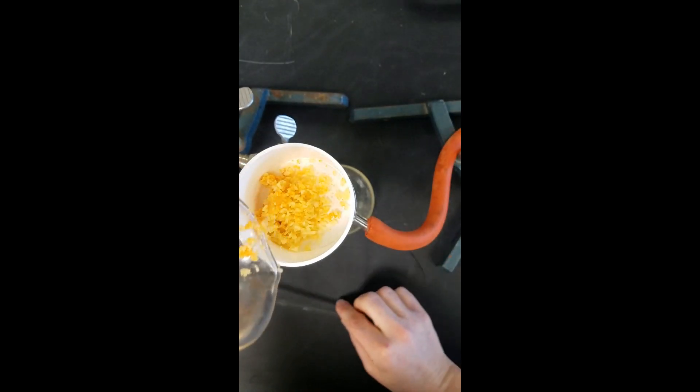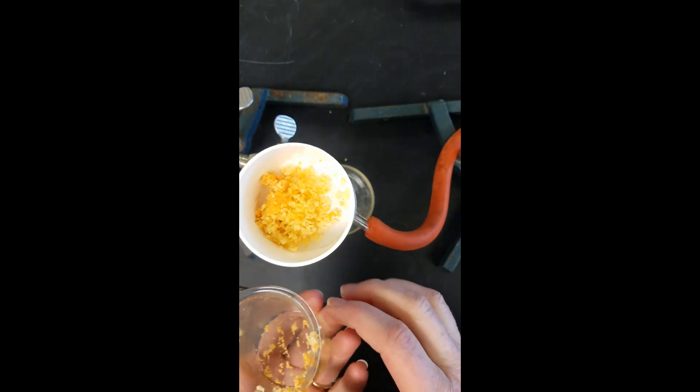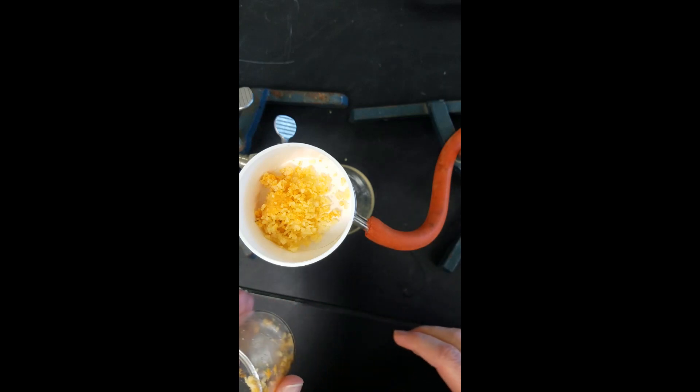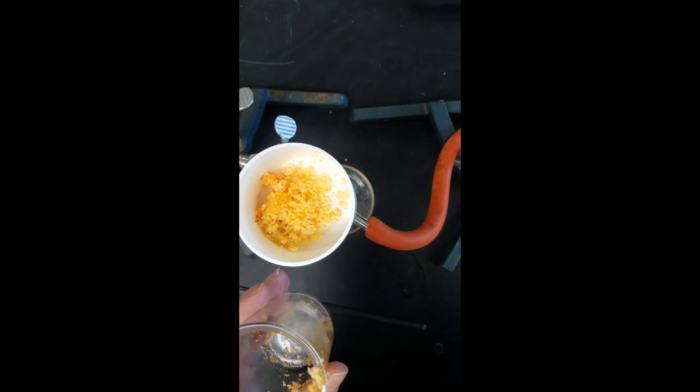And we are going to repeat this particular step two more times. So we are going to dump these chips back into the beaker and then add more petroleum ether, mix it for a minute, and pull it through the vacuum again.